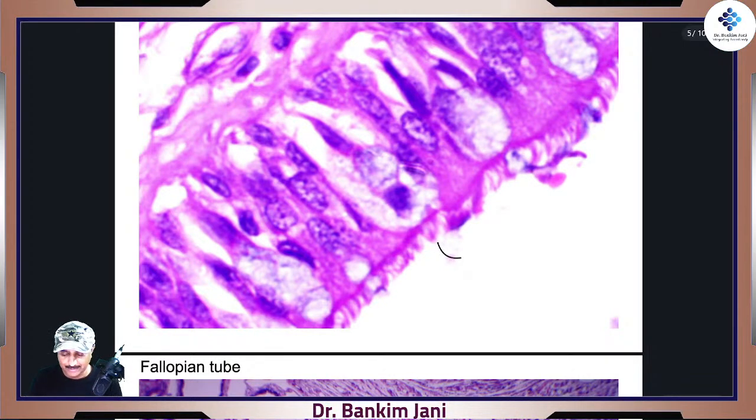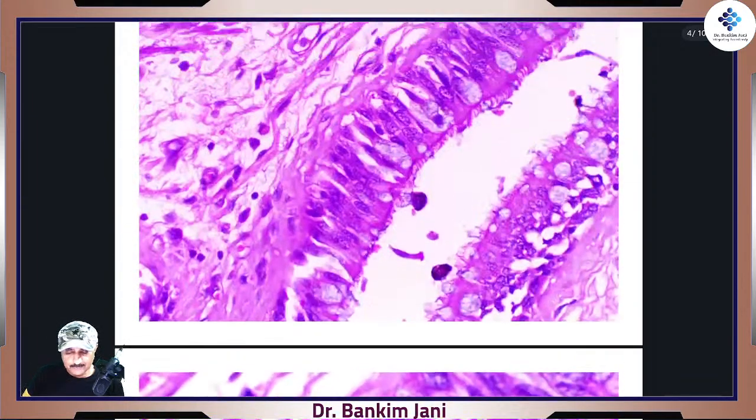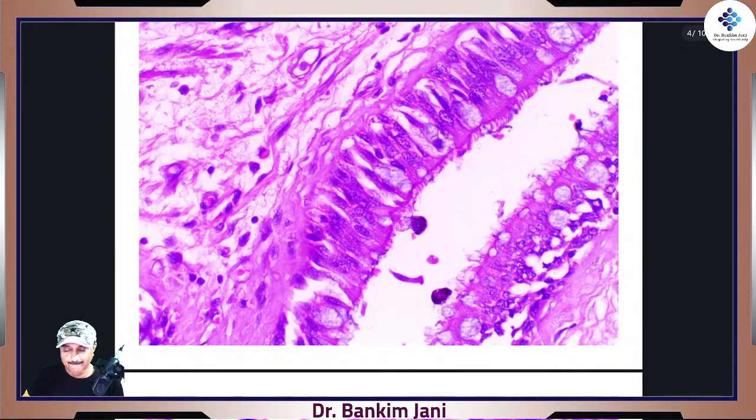Here are the cilia, right? They are cilia. See how nicely, and all those columnar cells up, right? See, these are the cilia.